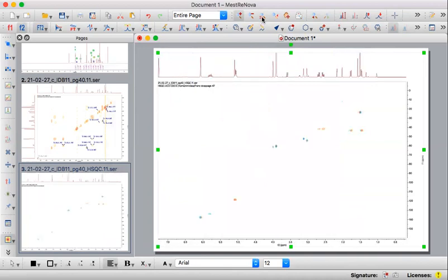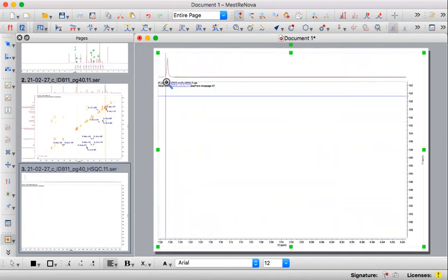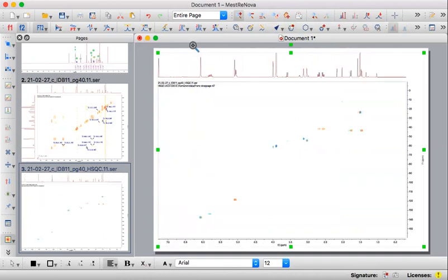Just like with the COSY, you also need to reference the HSQC, and it's referenced the exact same way as the COSY. I'm going to skip the referencing in this video, mainly because we do not see the signal for the chloroform in the HSQC. So I am not able to reference this because we don't have a referenceable signal. But you will have one in your spectra, and it's going to be referenced the exact same way that it was done in the COSY.